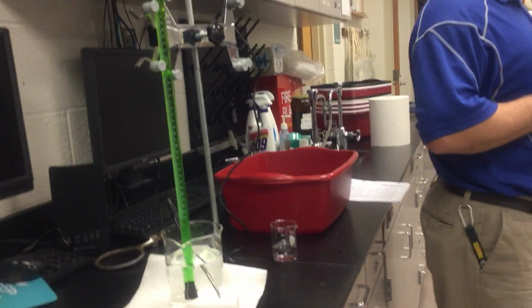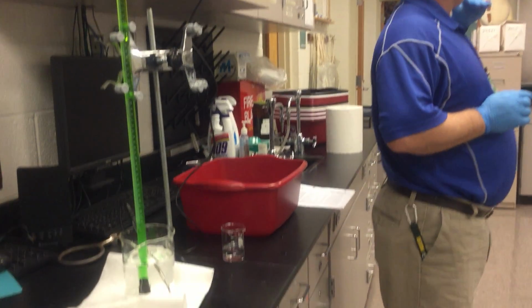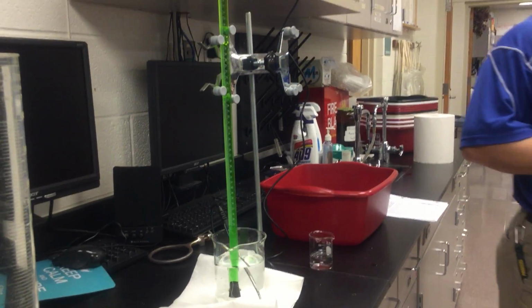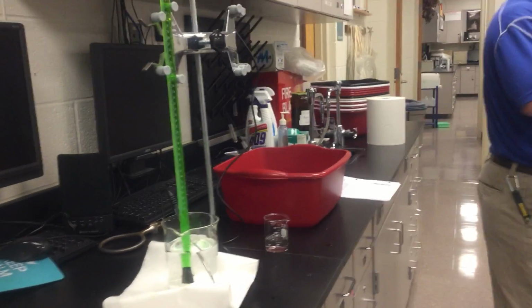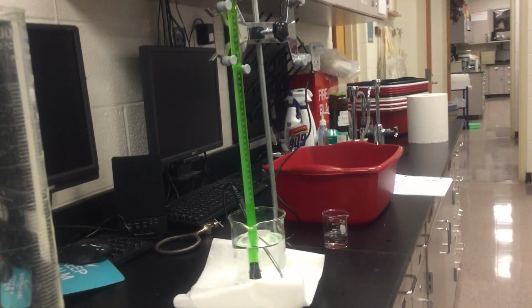But we are going to need to convert the pressure into our elevation. All right? Because what the weather channel does, to be able to compare the pressure from different places, they just convert it to what it would be at sea level.